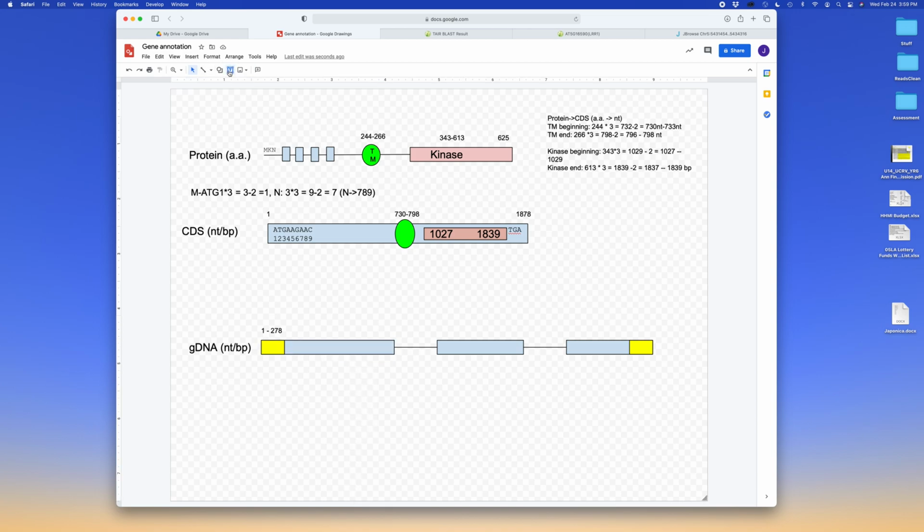Okay, we'll do it another way. So our ATG is like that, and that would be position 279. Right, so 279 is the position of the A in the ATG. So that's the start of my exon, and the end of the exon is, exon 1, 1563. There, that's the end. Okay, now just copy and paste that.